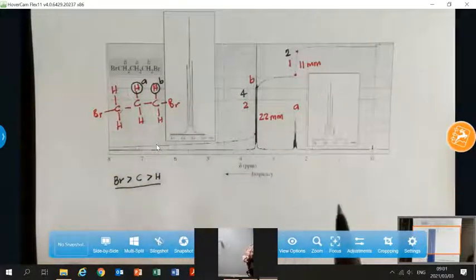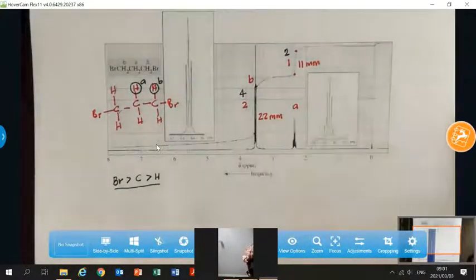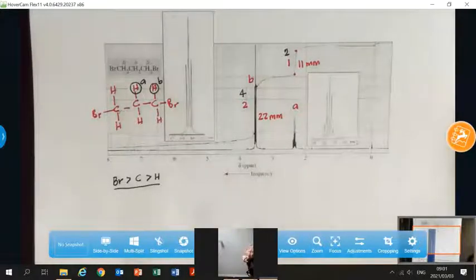So that explains now what the integration is. It also gives you a good explanation of what the shielding and de-shielding effects are with regard to the spectrum that we are just studying. I think I'm going to stop there for a while before I go on to the next part. And then I'm going to take some questions here.